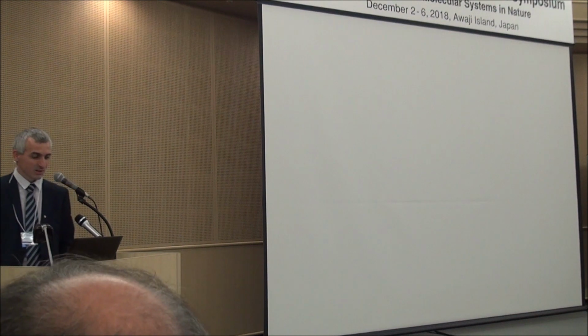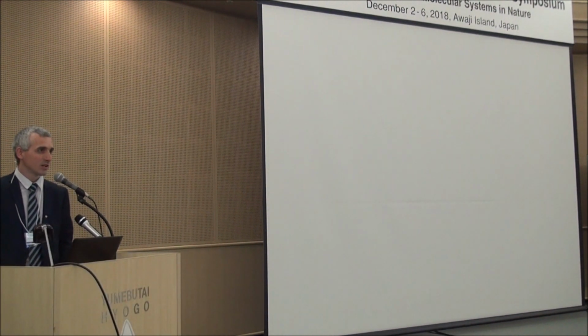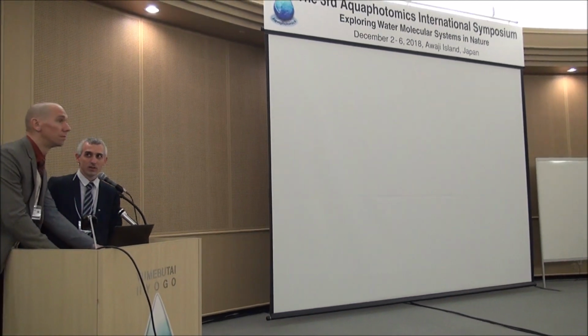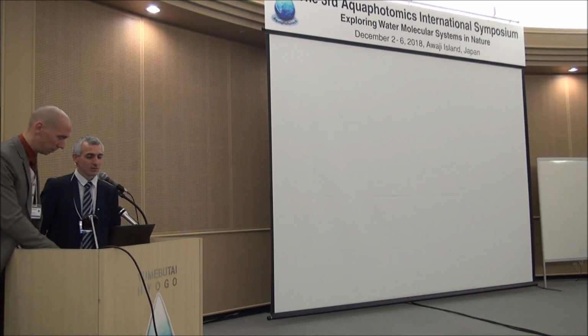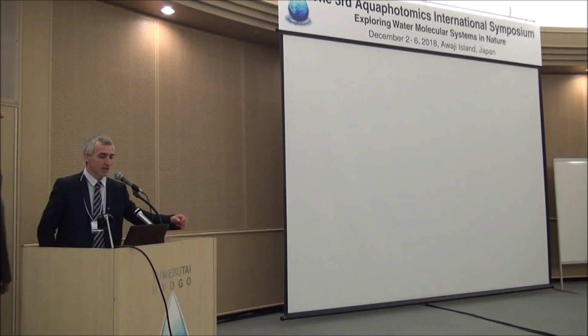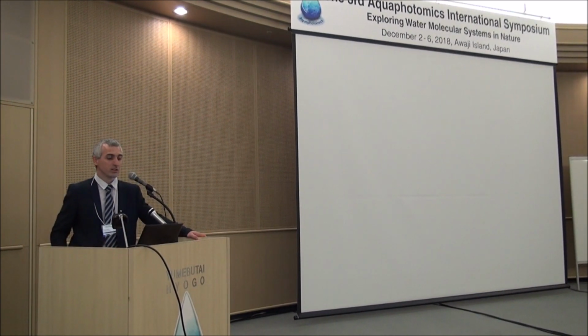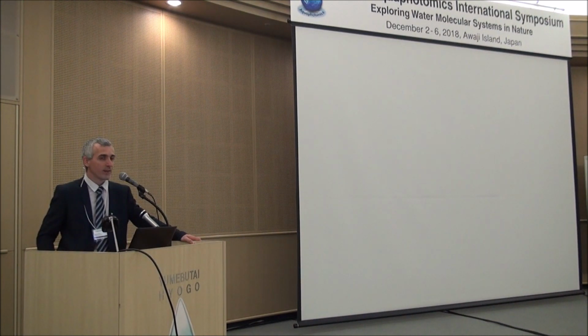To make the story short, it will be an interactive course. Everyone is very welcome to join us and install our software with Dr. Pollner, with Bernhard. We have been developing this aquap2 package. It's a multivariate data analysis framework with a focus on aquaphotomics techniques, to be correct with the title.